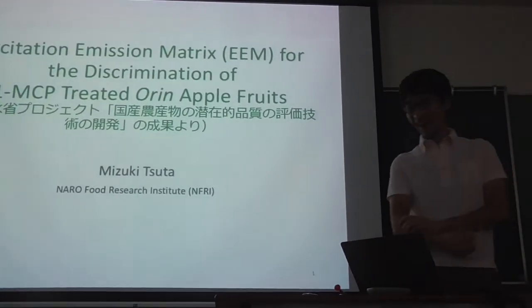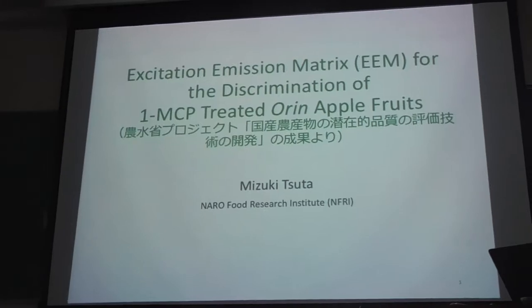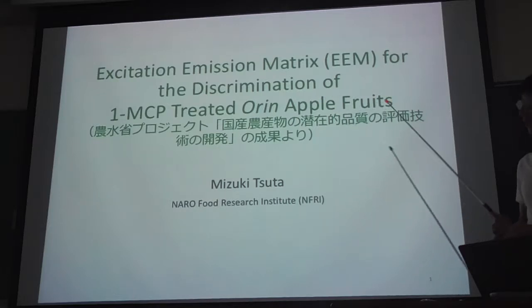I will enjoy that. Okay, now I'm going to present about excitation emission matrix, EEM, or what we call fluorescence fingerprint, for the discrimination of the 1-MCP treatment on apple fruits. And this is one result from the MATH project.